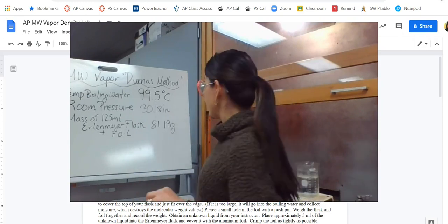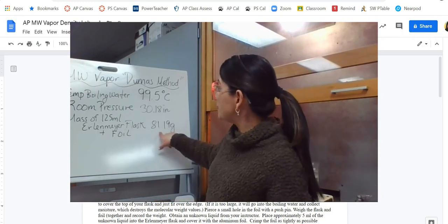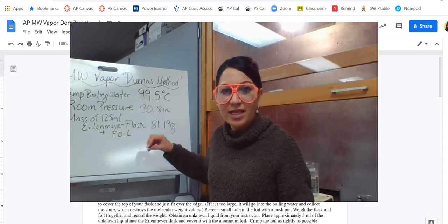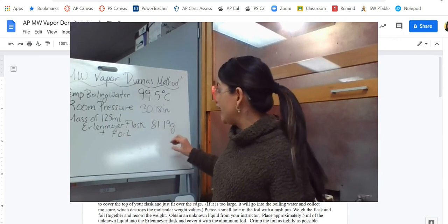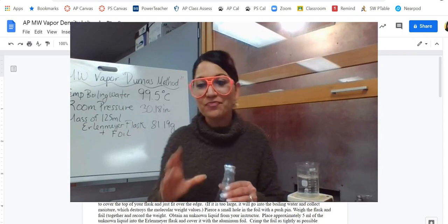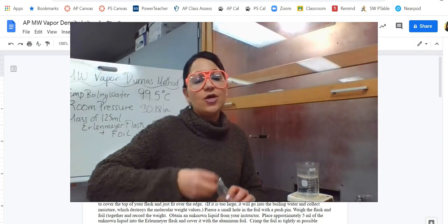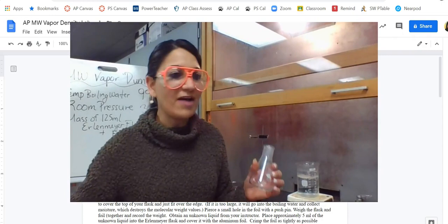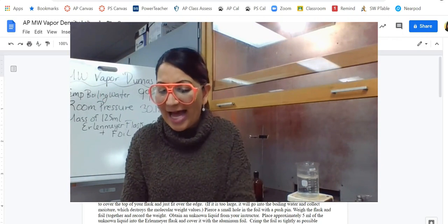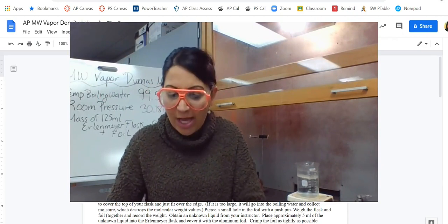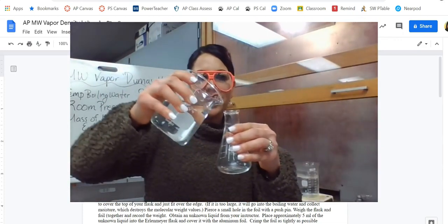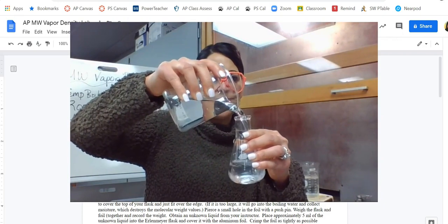So I took the gas and I condensed it, which means it should weigh exactly the same in the liquid state as it does in the gas state. Now, did our mass increase? Yes, it was at 81.19 grams when it was empty, and then when I added the 5 milliliters and obviously boiled that off, then I took the gas and condensed it and now we're at 81.56 grams. So what's the last thing that we need? The last thing that we need is we know that this is a 125 milliliter flask, but like I said earlier, that is not the volume. So I've got some empty space in there. So what I'm going to do is I am going to fill this with water.